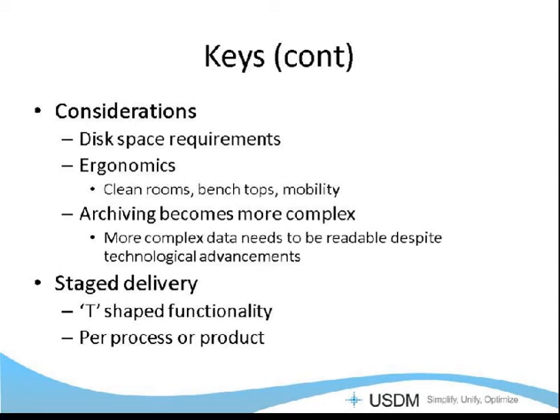Also, ergonomics. A lot of analysts don't stay at the bench. They go to the clean rooms, or they travel for environmental monitoring with carts, and they might do some valve testing on water systems. There's a lot of moving around. People don't just sit at their desk. You have to take into account the durability of the hardware that you use. They might want barcoding systems, so you have to look into having barcoding rather than typing into systems.